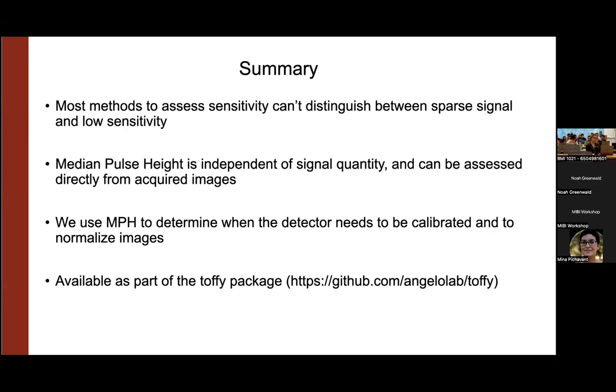Should there be a minimum number of tiles if you're doing a tiled image? If you're randomly acquiring a 2x2, does it really matter because they're still all really close to each other? 2x2 probably doesn't matter. I feel like randomizing your tiles in your runs is kind of like brushing your teeth.